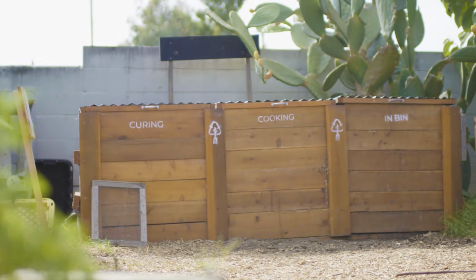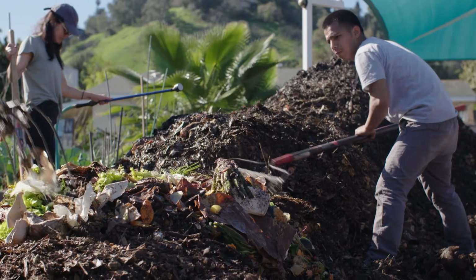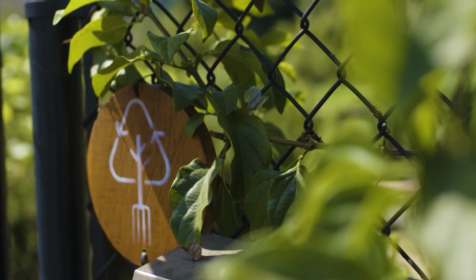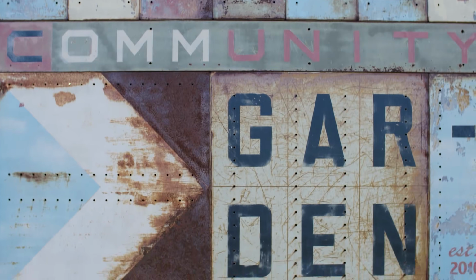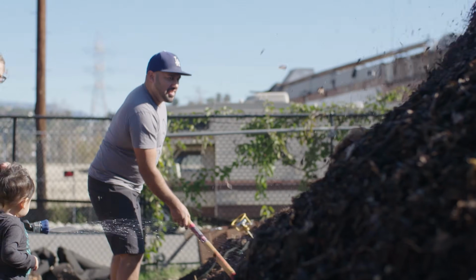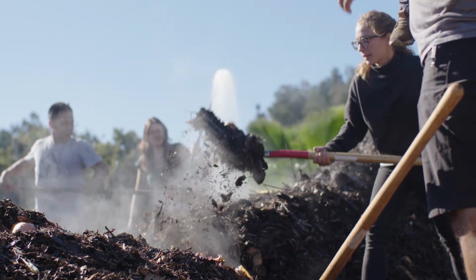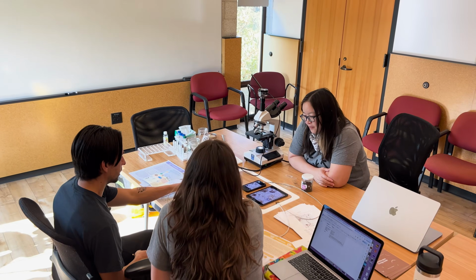Ultimately, there is no one who understands your soils and compost better than you and your community, since you are the ones stewarding it and witnessing its management. Whether you have been an avid sheet mulcher for years or are just starting a garden on a hillside by a construction site, your understanding of the soil's history can be just as important as what a microscope will tell you. By combining any findings from a microscopy session with your unique understanding of your soil, you can develop an effective plan to amend your compost recipe or improve your management practices.